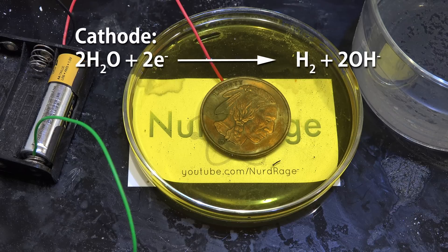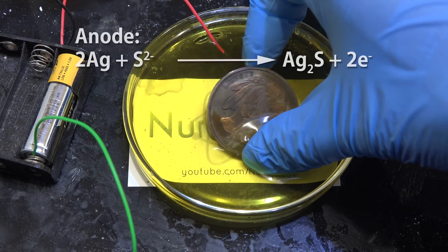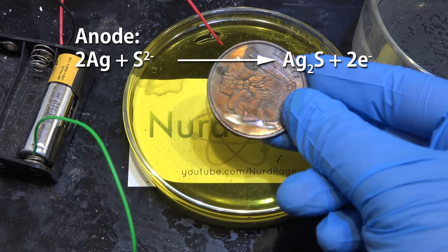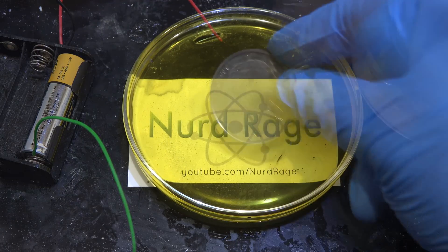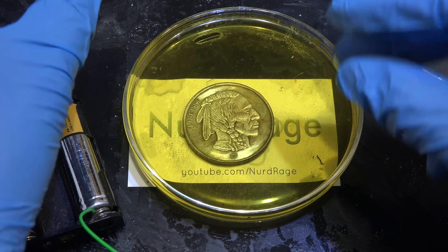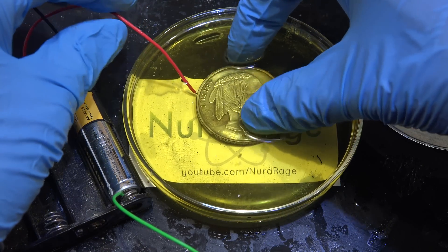What's happening is at the cathode we're just generating hydrogen gas. But at the anode we're oxidizing the silver and combining it with sulfide ions to make silver sulfide, which is the tarnish you see on silver. The final color is dependent on the thickness of the silver sulfide layer.